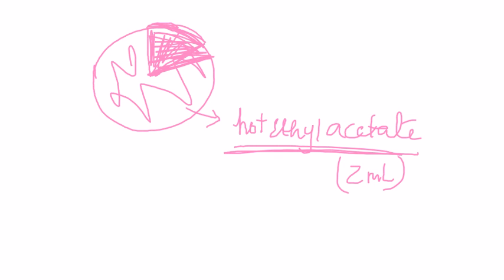You might also see that as you add your ethyl acetate, your solid will go in, and maybe some oily droplets are going to appear. Those oily droplets are nothing but unreacted acetic anhydride. Depending on how much is in there, I might have to ask you to use a dropper to pull that away, so that it helps in the crystallization. But if there's only one or two, then you don't have to worry about it. It should still work. As you cool the mixture to room temperature or in an ice bath, you should see the crystals.